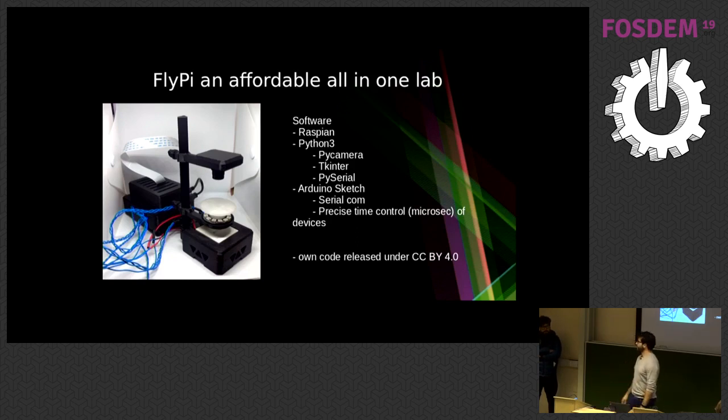Yeah. What is the image resolution of the camera? So the question is, what is the image resolution of the camera? For the Pi camera, you have two versions. One of them is 5 megapixels, and the other one is 8. And right now, 5 megapixels is more than enough for what we need. The problem here is not how many pixels you can put inside the sensor, because they're already 1 micron apart from each other. So the pixels themselves are small enough. The problem is the optics or some smart algorithm to process the data and get it working.